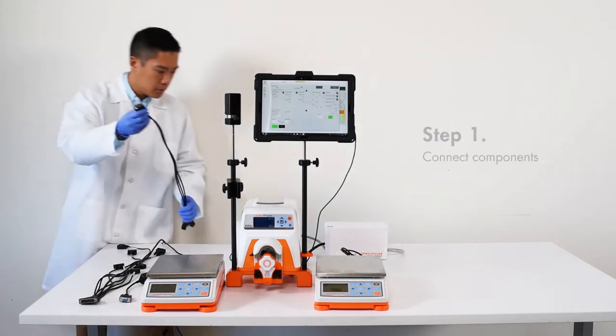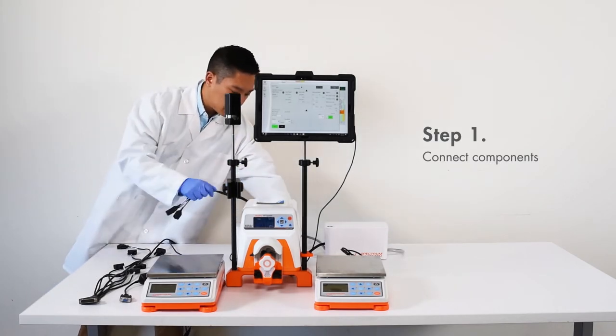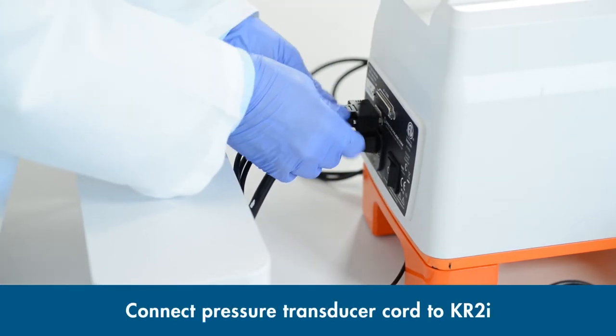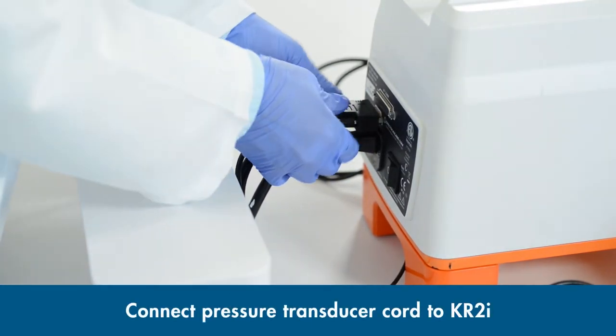To begin, connect the power cord, pressure transducer cable, and KFCOM octopus cable to the KR2i. Ensure that the connections are tight and properly secured.